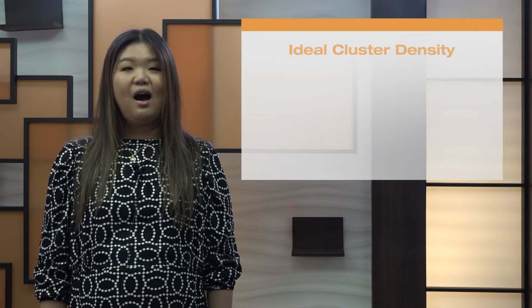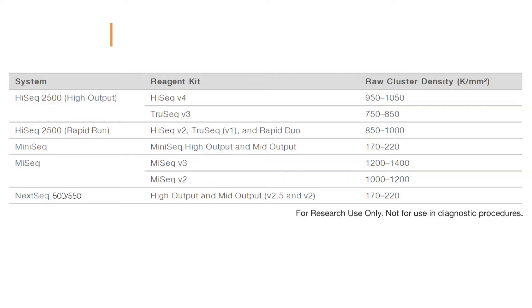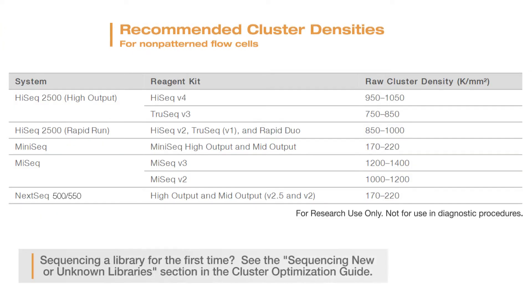Thanks, Tim. Performing a run at optimal cluster density involves finding a balance between under clustering and over clustering. Ideally, we want to sequence at a high enough density to maximize total data output while maintaining a low enough density to avoid over clustering. Illumina has recommended target densities for non-patterned flow cells. Raw cluster density is displayed in thousands of clusters per square millimeter and measures how many clusters are identified on the flow cell, regardless of whether they pass quality filter. Now let's discuss some common clustering issues and how to prevent them from decreasing data quality and yield.